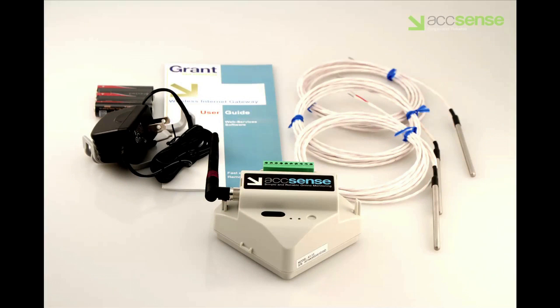An AC adapter, three AA batteries for backup power, a user guide, and a pinout diagram.